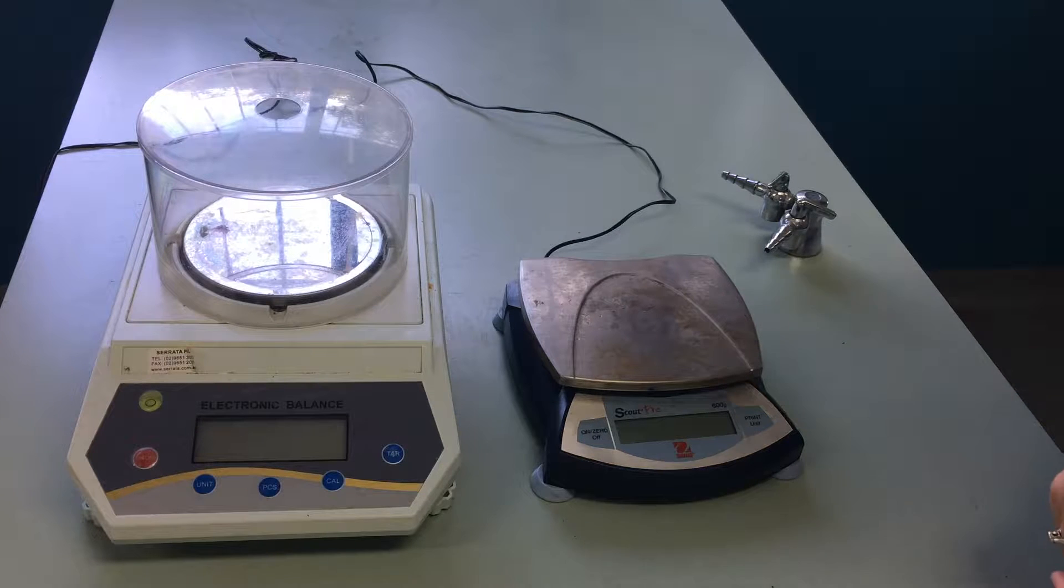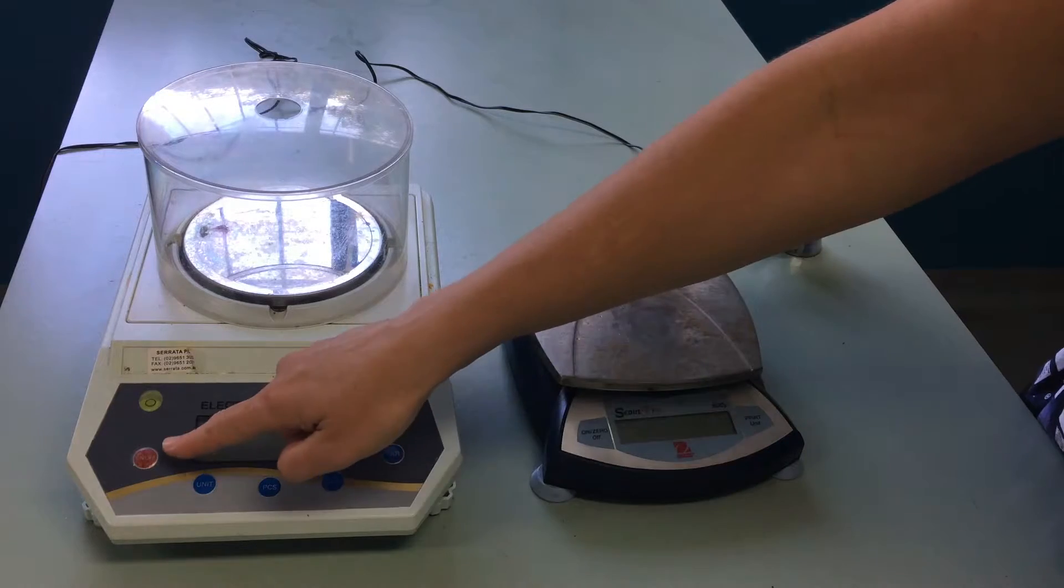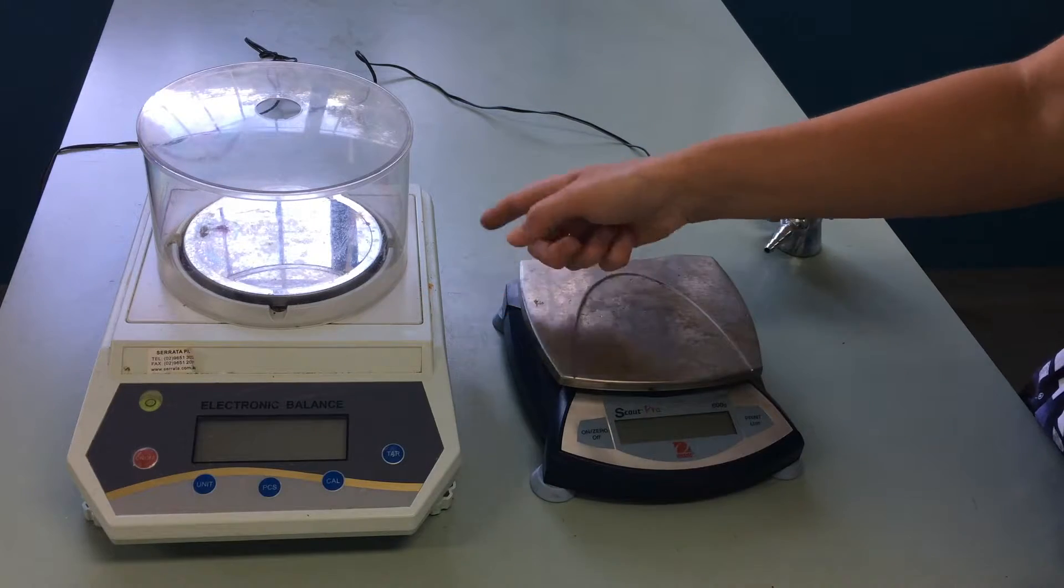Today I'm going to show you how to weigh the mass of an object using an electronic balance. All electronic balances will have an on-off button at the front here, or perhaps a switch on the side.